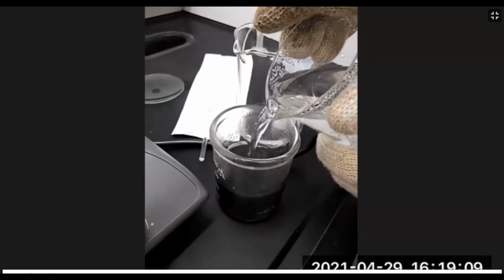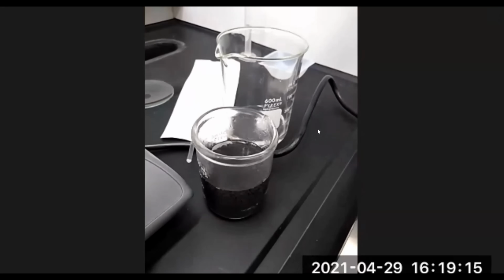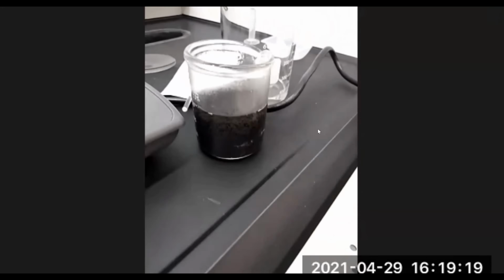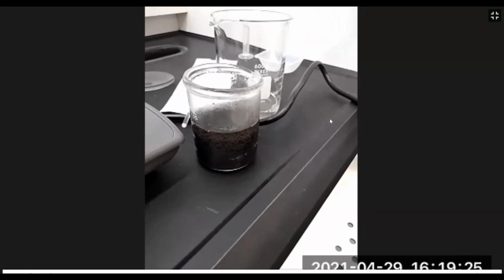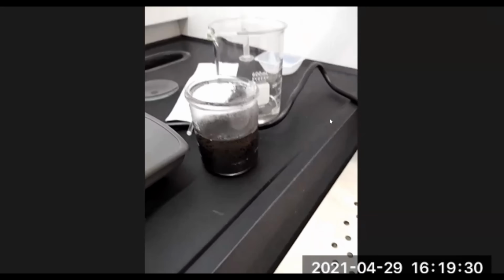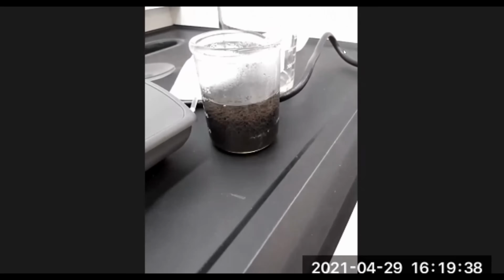So he's adding the hot water to the solution, to the precipitate, to wash it, to get out any residual of the solution that's left. And so again, you let it settle and you go through the same setup as before. Once it settles, you try to discard or decant as much of the solution as you can while leaving the precipitate in the beaker.